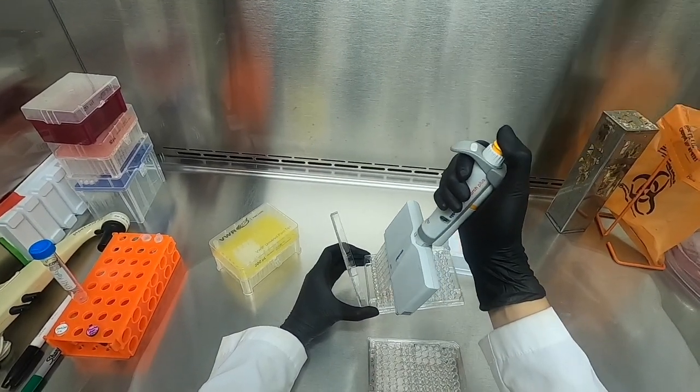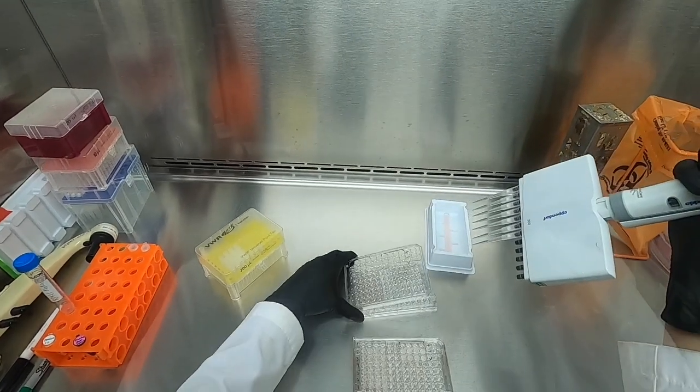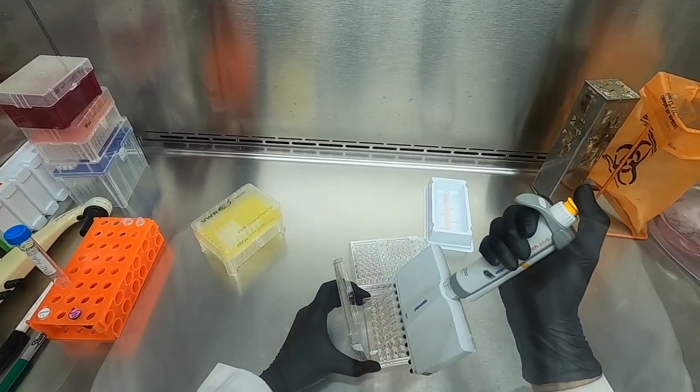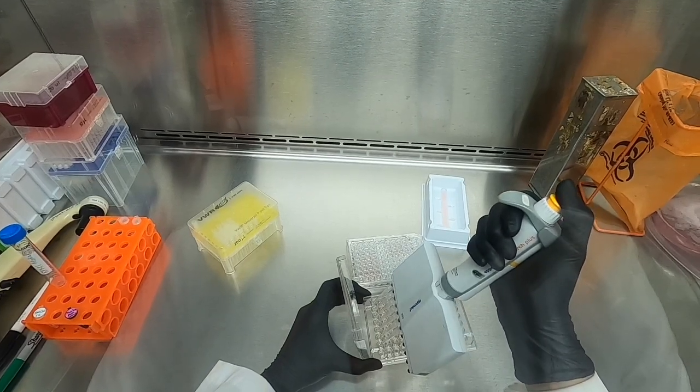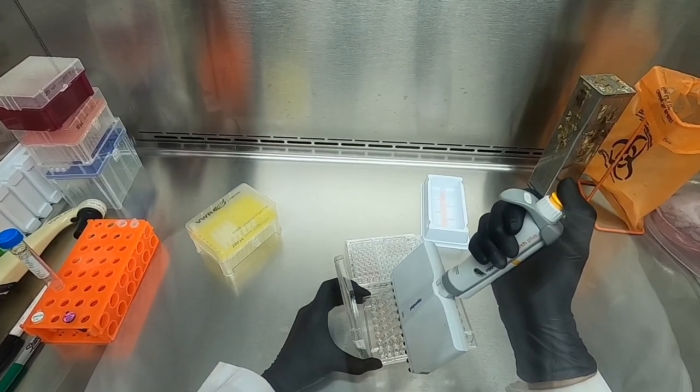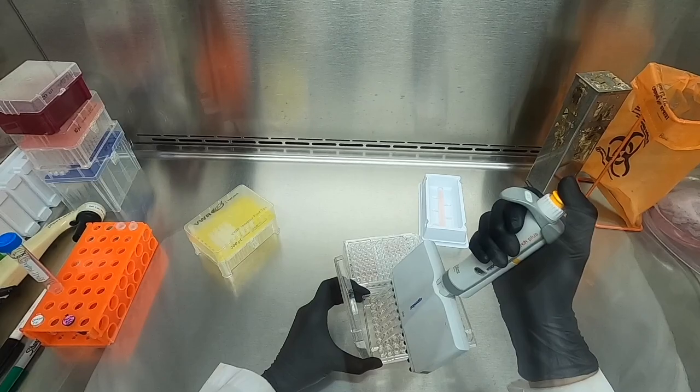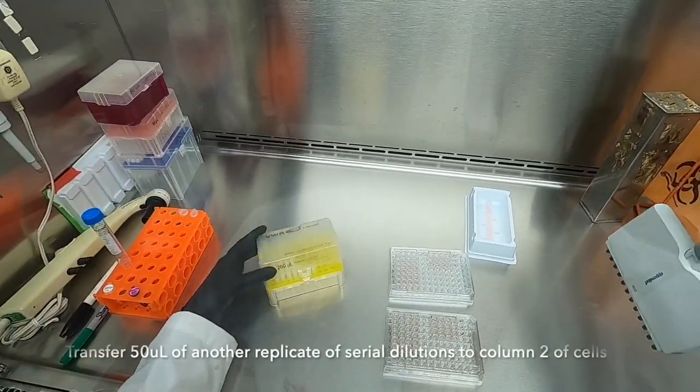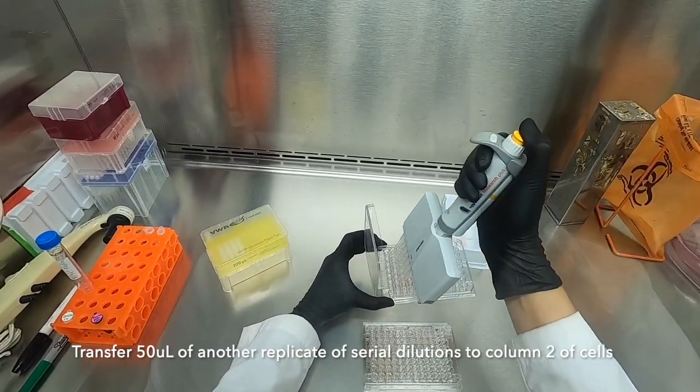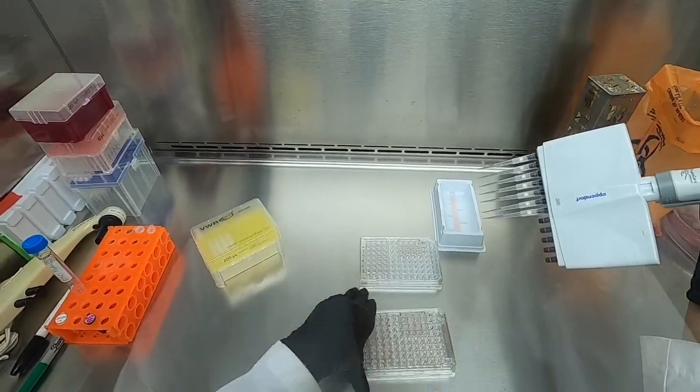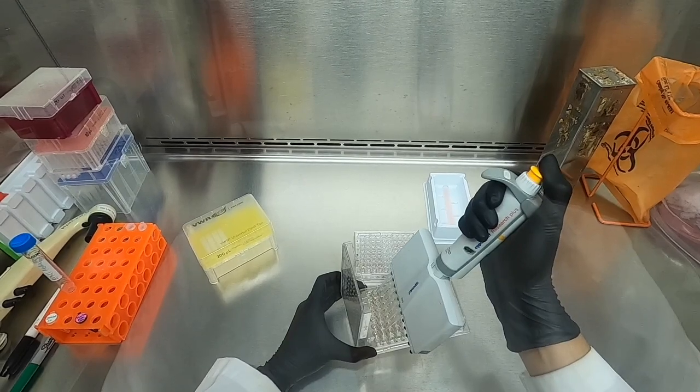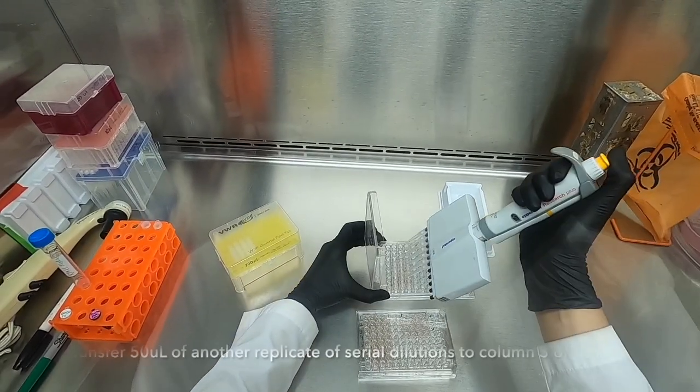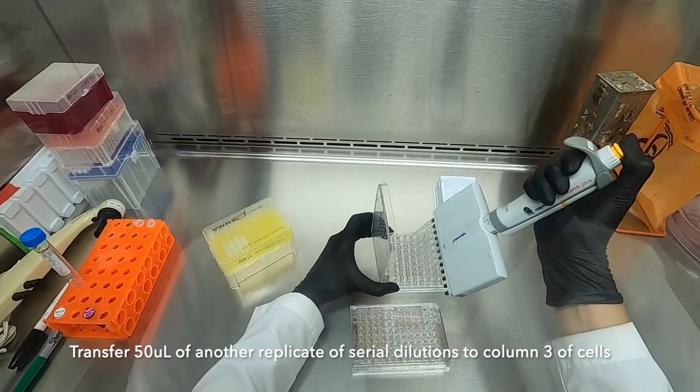We had previously established that the highest concentration in our capsaicin gradient was 200 micromolar and our lowest concentration was 3 micromolar. If we're adding 50 microliters of this gradient to 100 microliters of media, this means that our highest concentration is now 66 micromolar and our lowest concentration is 1 micromolar, which matches perfectly with the concentration gradient provided in your manuals.